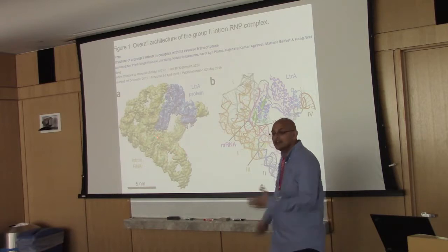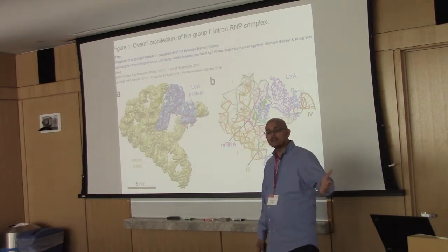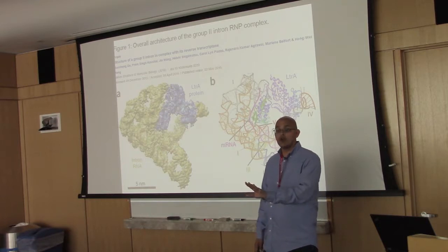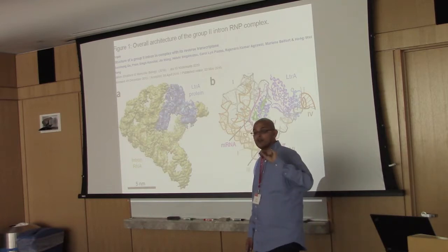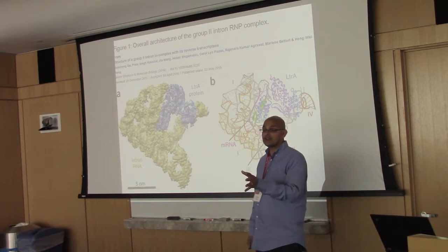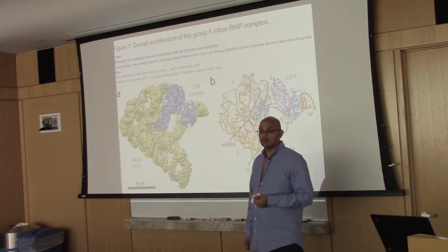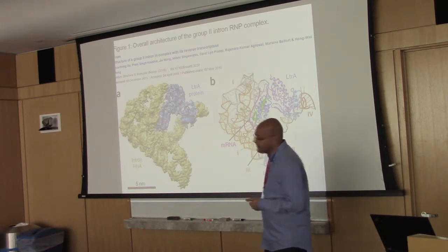Obviously, the EM structure is at much higher resolution than the small-angle scattering, but the scattering was generally consistent. So it was gratifying that in that particular case it worked out pretty well with a very modest amount of material. The nice thing about the small-angle scattering technique is that it's versatile. If you have a problem, you can probably find a solution to it by working at the sample environment stage. Okay.